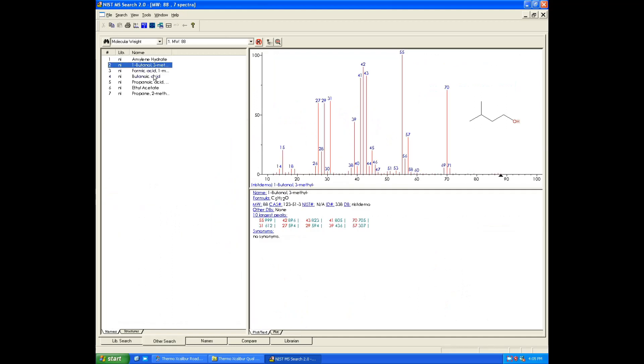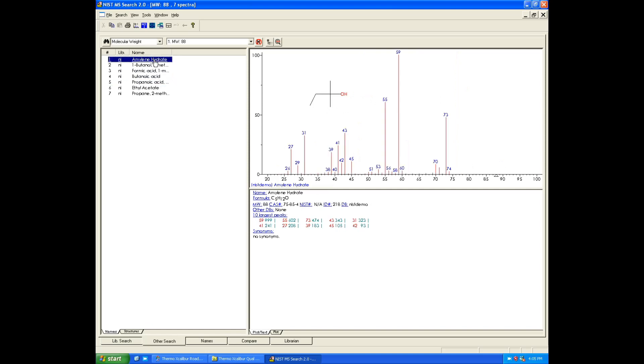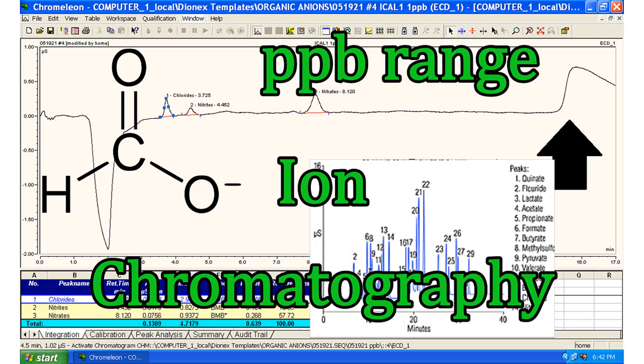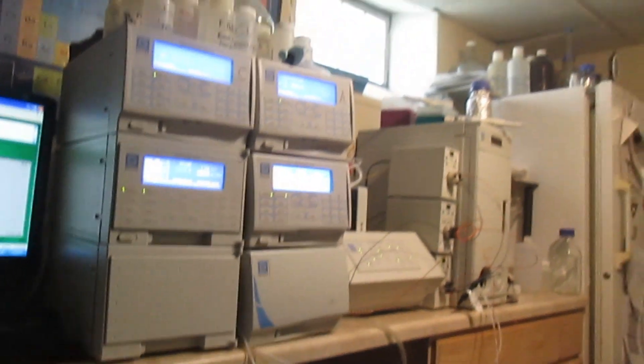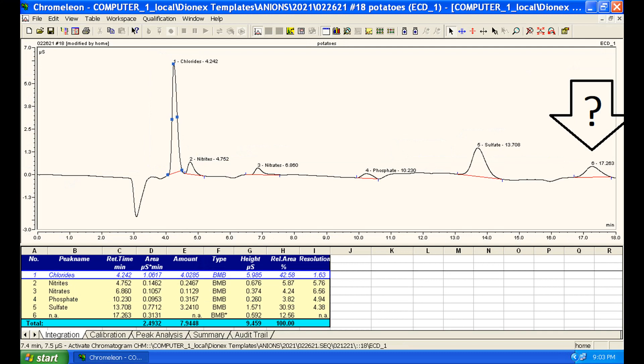The mass spectrometer is very good at identifying pure chemicals, but a mix of even a few molecules can rapidly become a very complex mass. A chromatograph is often the sample source for the intake of the mass spec. That way, pure chemicals pre-separated by the chromatograph can easily be identified by the mass spectrometer. But enough of the theory — let me share a few preliminary results and analysis.